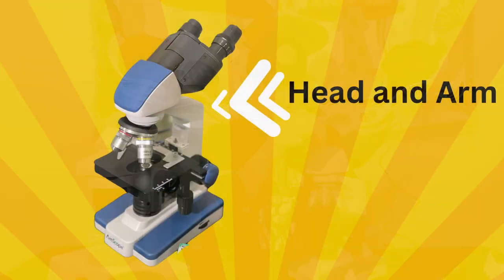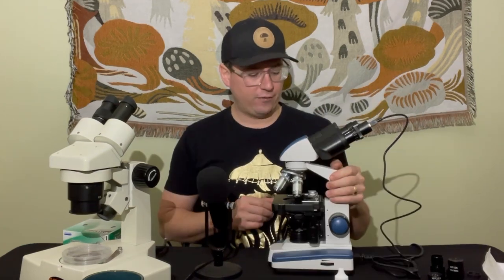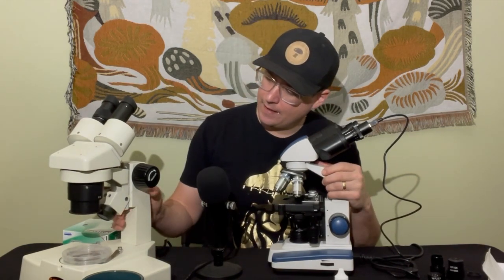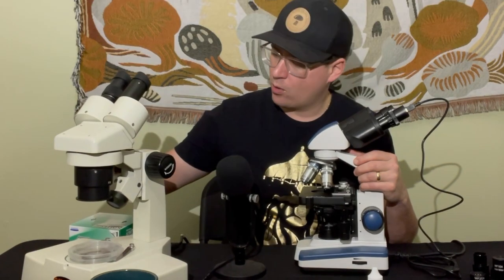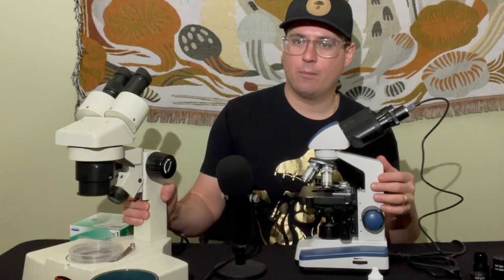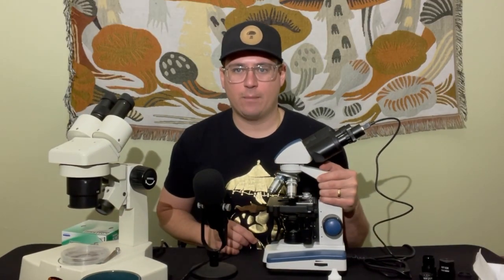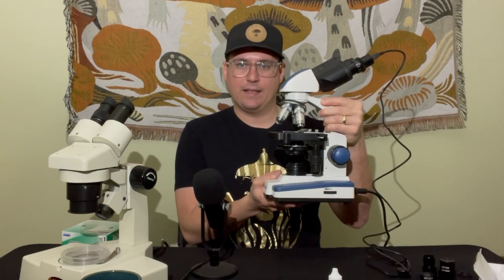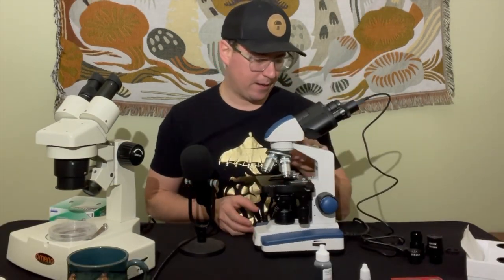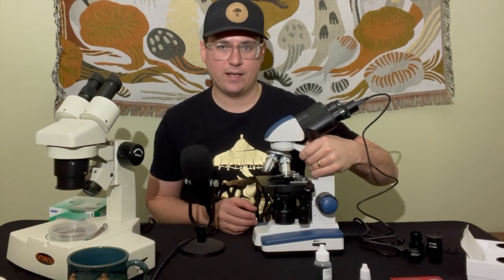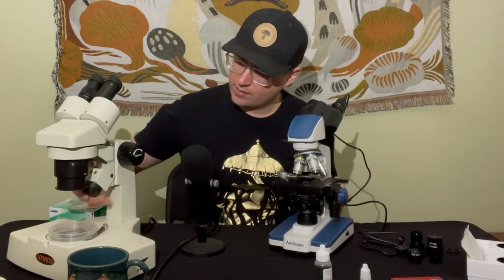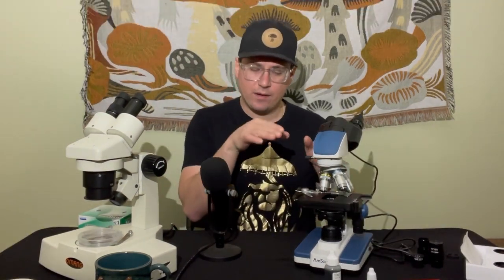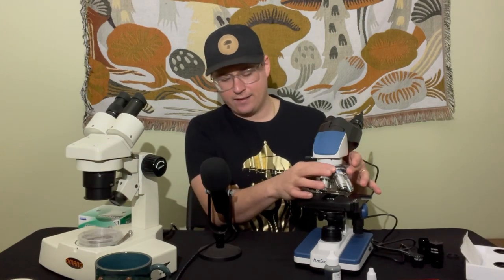Moving down, we have the head and arm. These are really important features. I like the AmScopes because they have really solid arms. One thing to note is that the coarse adjustment on this scope is located right in the middle of the arm where you'd hold it. When transporting a microscope, always hold it with one hand on the arm and the other at the base for a solid grip.